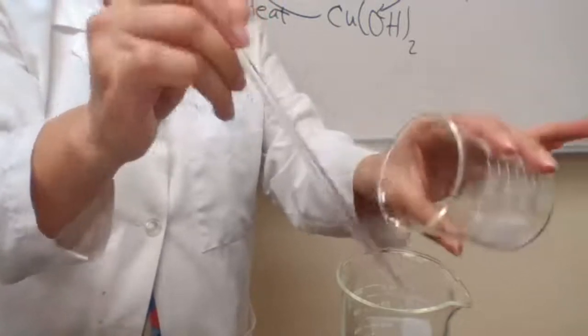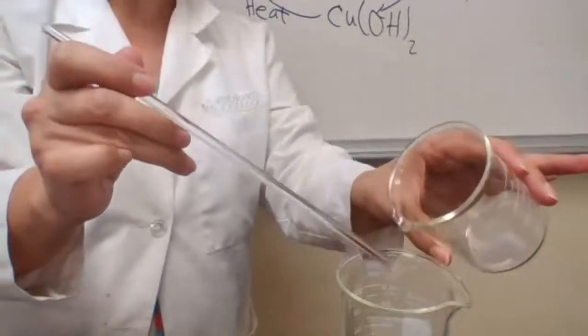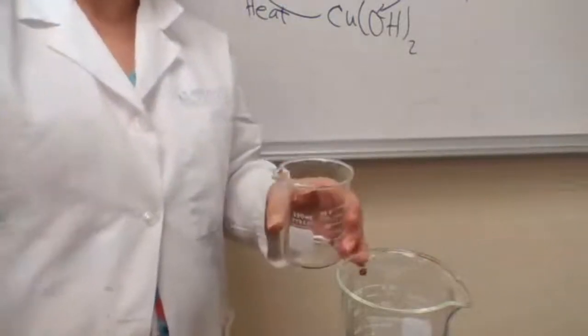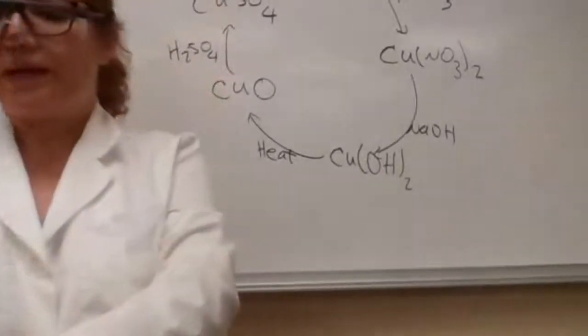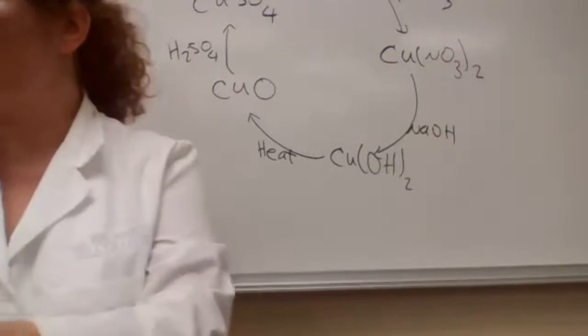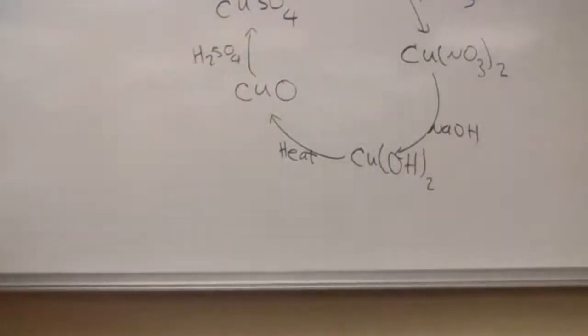You're not going to get all the solvent or the solution out, but you will get most of the solution out. You would separate most of the solution. The other technique that you are going to learn is filtration, gravity filtration.